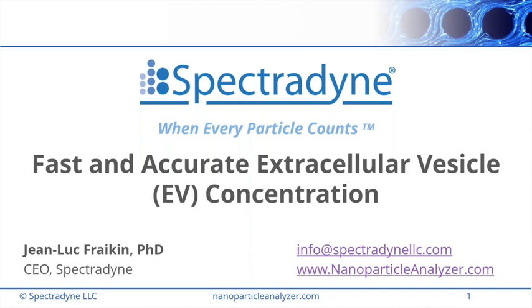Yep, sure. So we have different cartridge sizes that span different measurement size ranges, just because of the way the technology is fundamentally designed: any given cartridge design has a certain range of applicable sizes. The TS300 cartridge measures down to 50 nanometers, and the TS400 cartridges span a different range with a different limit of detection. We are continually working to push the limit of detection smaller. As Dr. Paulaitis showed some preliminary results in his talk, we have cartridges under development that can go down into the 30 nanometer size range, but they're not quite ready for prime time yet.